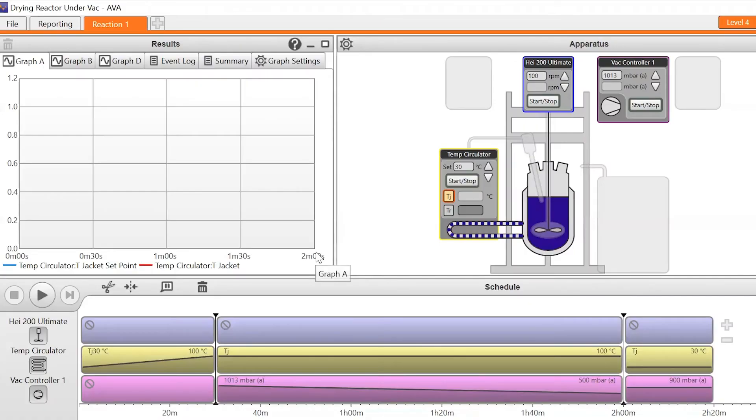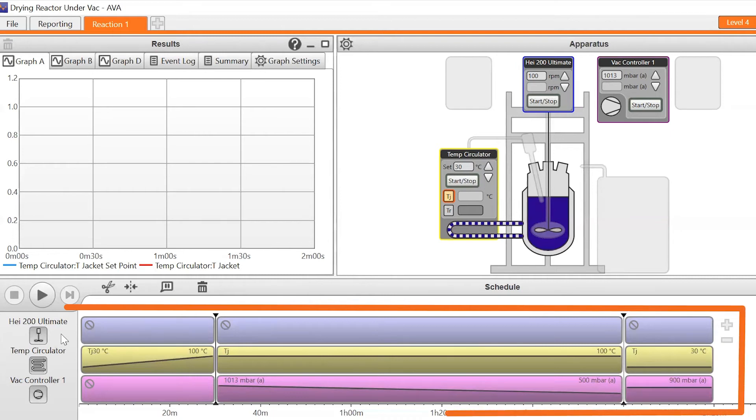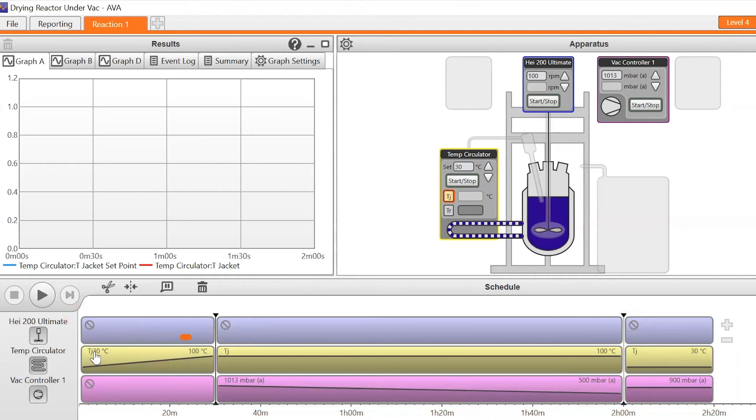With Ava, we can use an overhead stirrer and also a circulator for controlling temperature — normally on jacket control, even if a process temperature control is attached to the system. We can have a vacuum controller connected to a vacuum pump and then put in a simple program to control the jacket temperature to, for example, 100 degrees centigrade, and hold at 100 degrees for a period of time. Simultaneously, we can ramp the vacuum down to approximately 500 millibar.